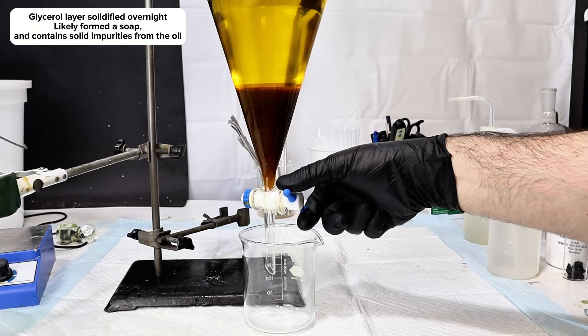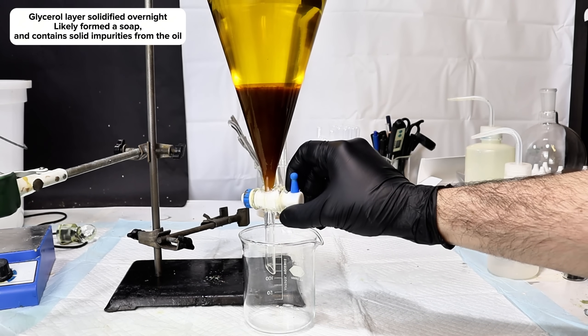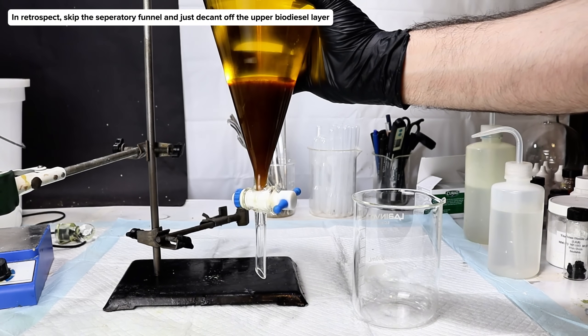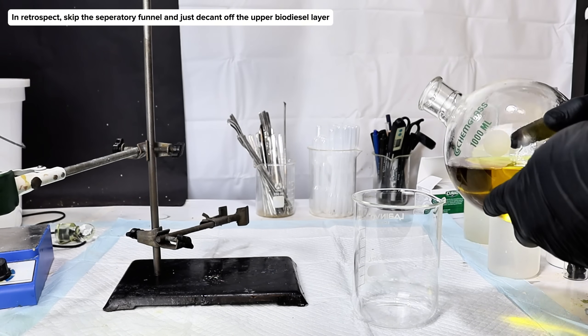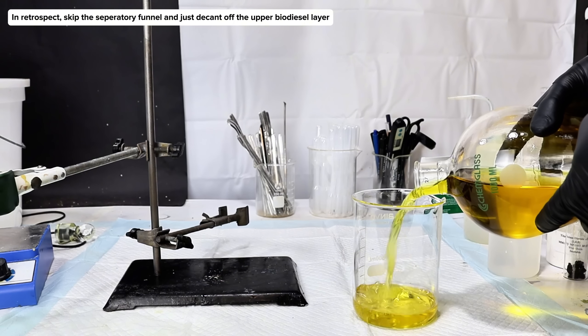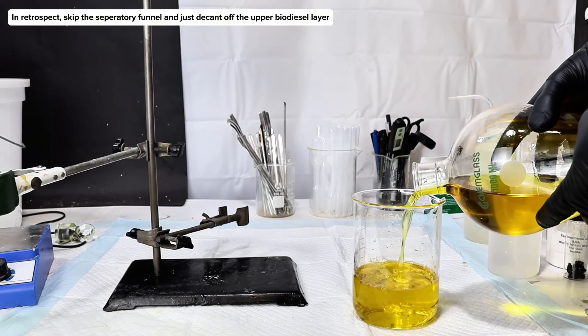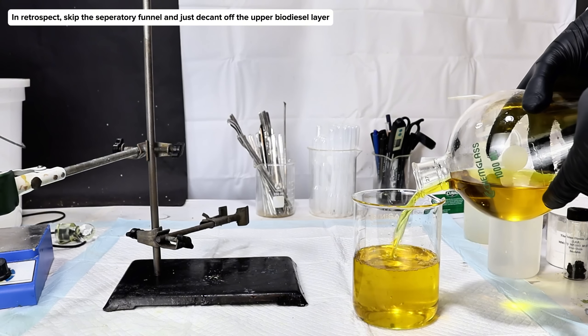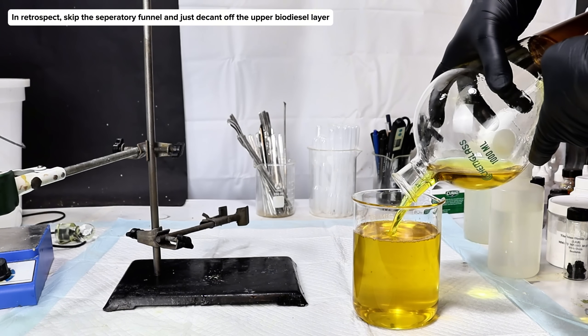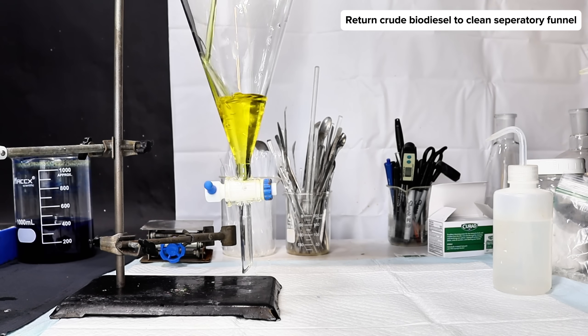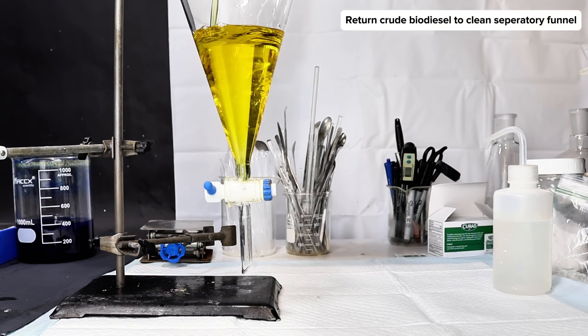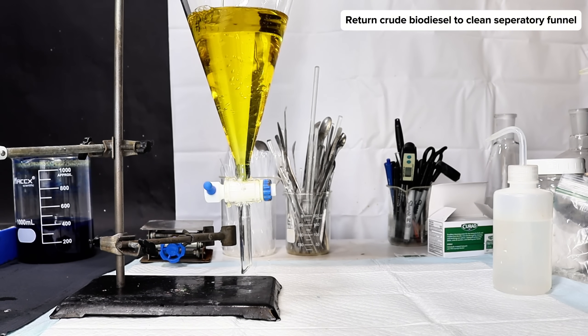I suspect this is mostly due to the fact that the glycerol layer likely contains all of the water-insoluble impurities that were in the oil. It's also probably due to the glycerol forming soap with any water that was hanging around and some unreacted triglycerides. Regardless, I went ahead and just decanted off my crude biodiesel layer and rinsed the glycerol soap mess out of my separatory funnel.